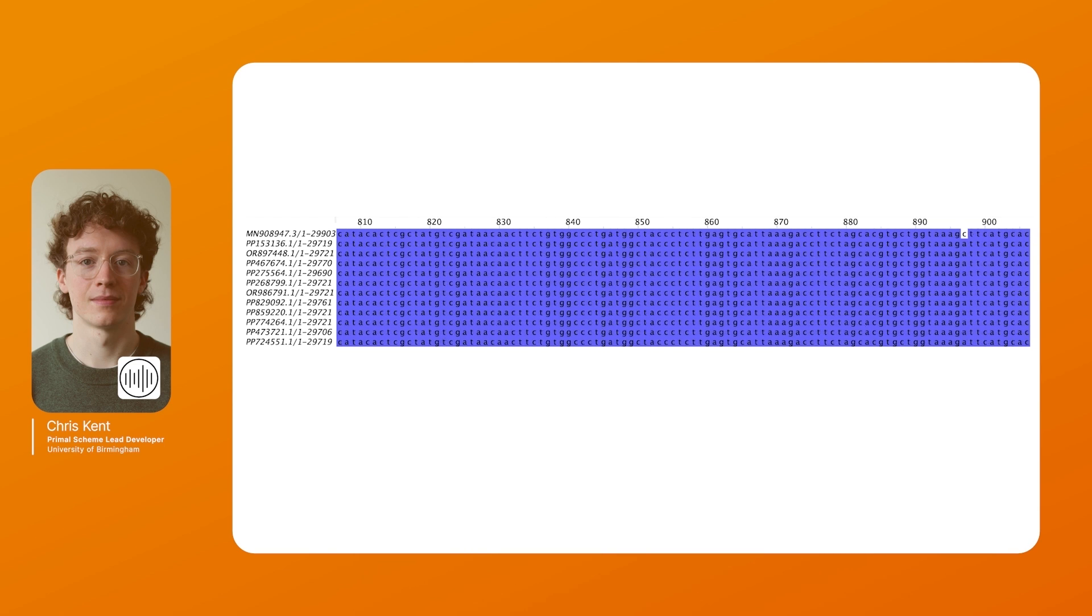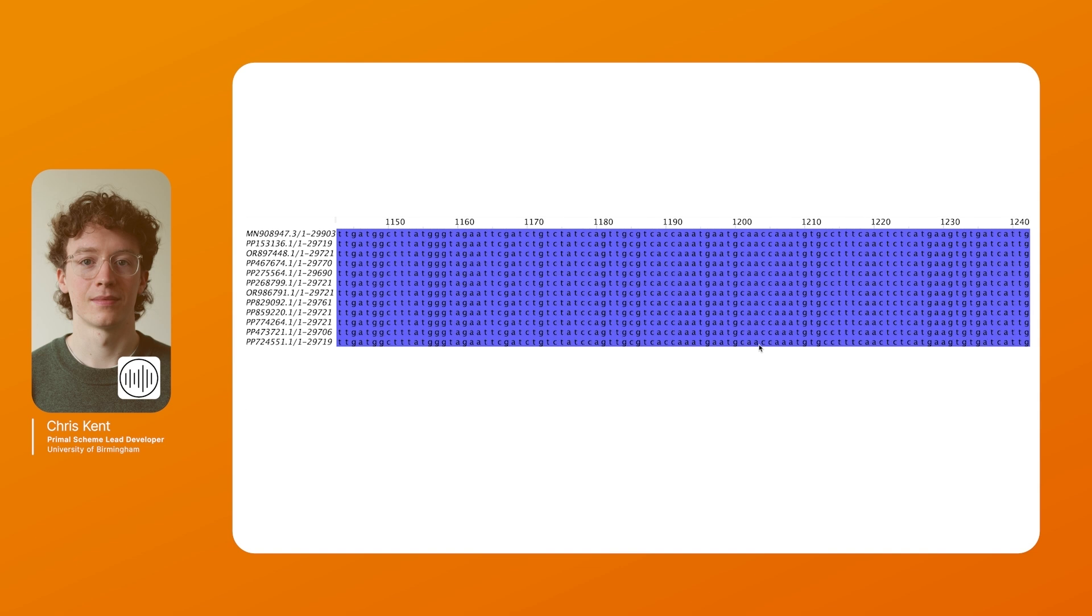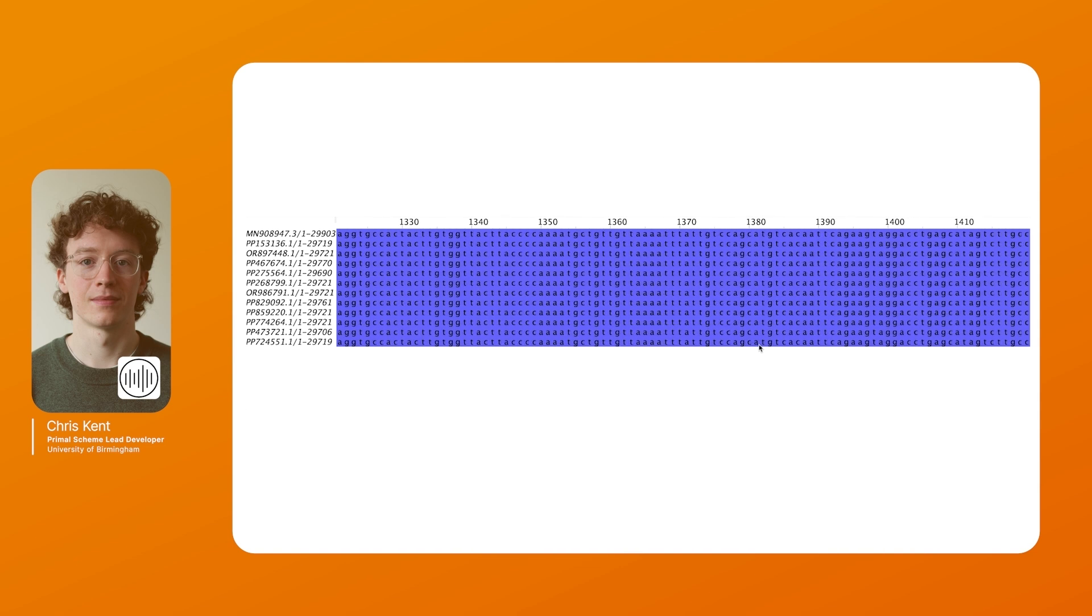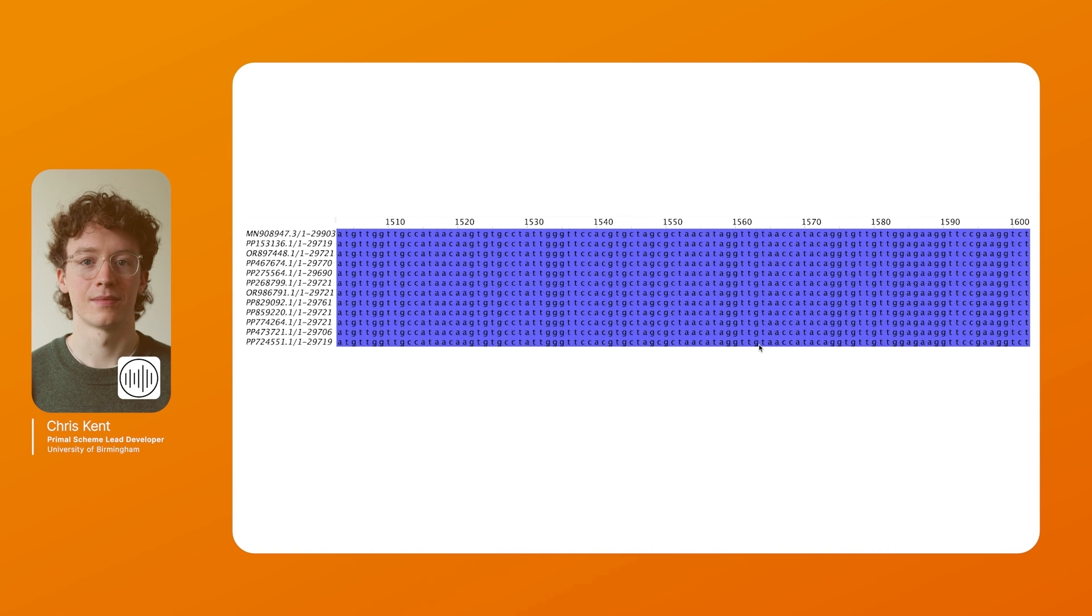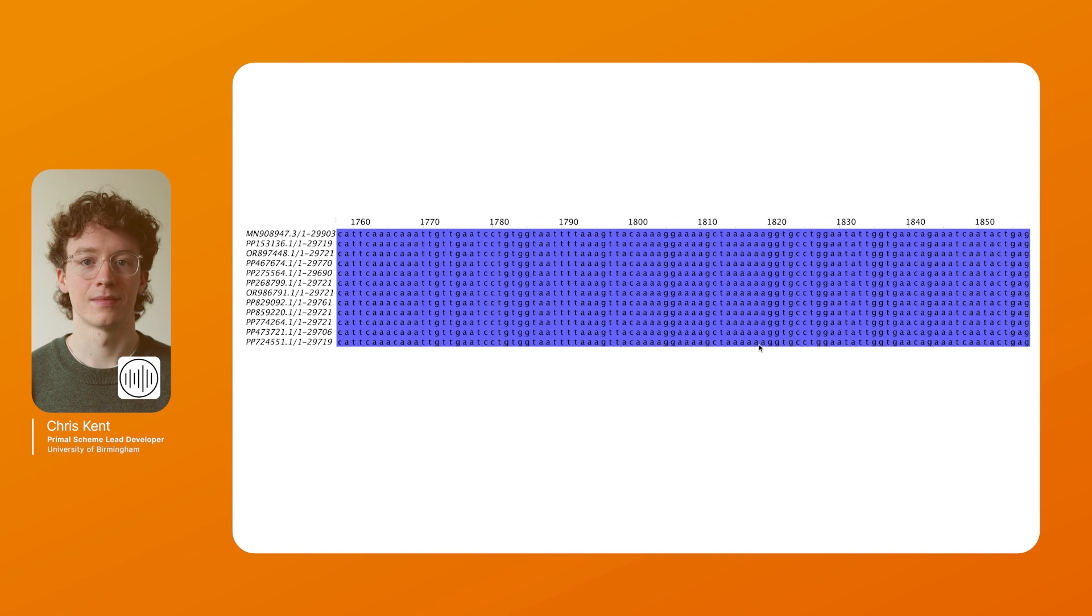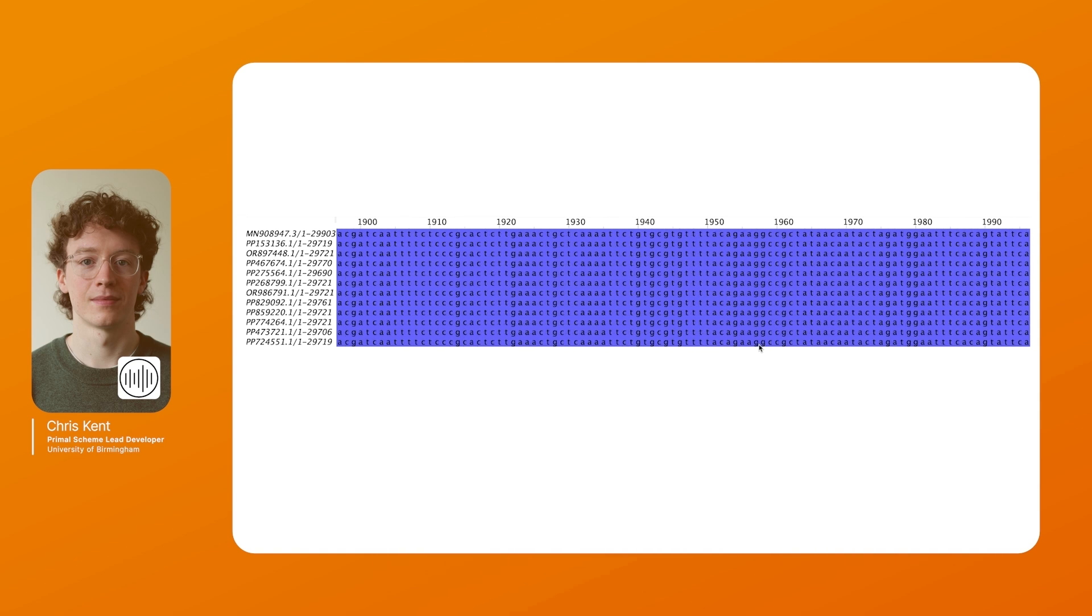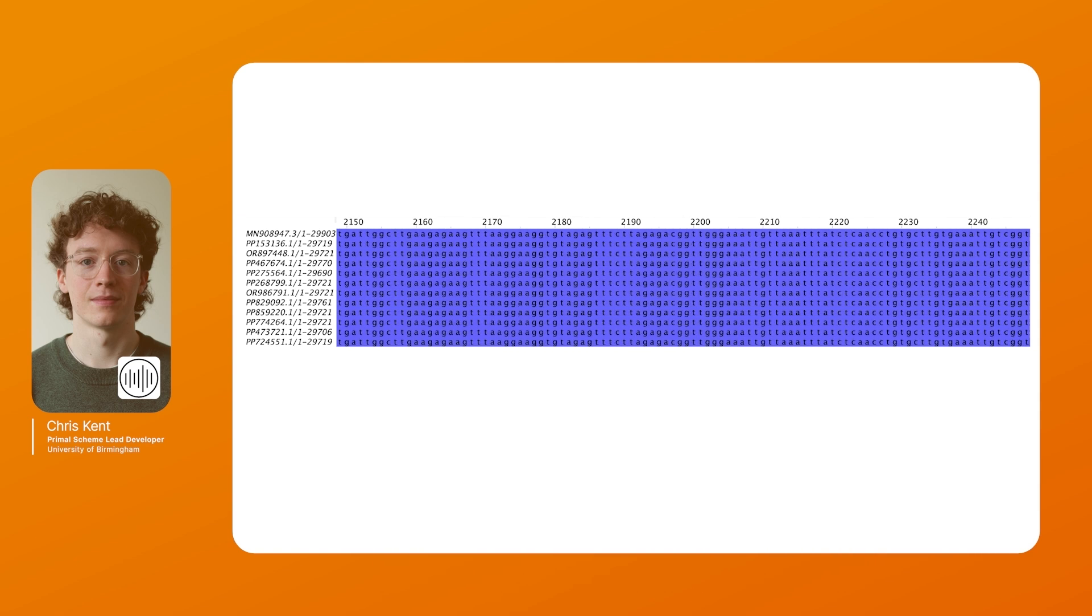Something to look out for is if you have large insertions or changes in gene synteny. That's one of the issues of Primal Scheme 3. Large gaps or large stretches of N can interfere with the algorithm. It can handle them fairly well but it does decrease the quality of the scheme.